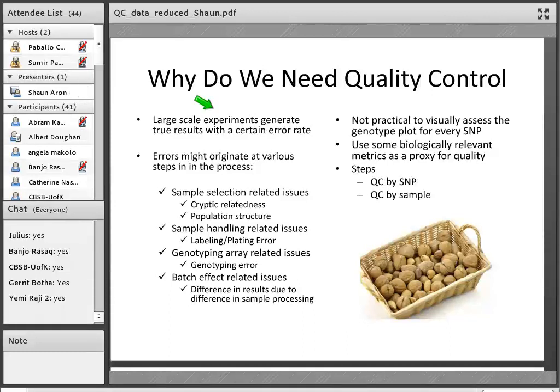In terms of where these errors might originate, there are various steps in the process. The first is sample selection-related issues such as relatedness or population structure in your data. In terms of sample handling-related issues, something might have gone wrong when labeling or plating samples — there might have been mix-ups. You can have genotype array-related issues — any large-scale experiment has some level of error. And you can also have batch effect-related issues: if you process samples in different batches, differences in handling could lead to differences in your results.